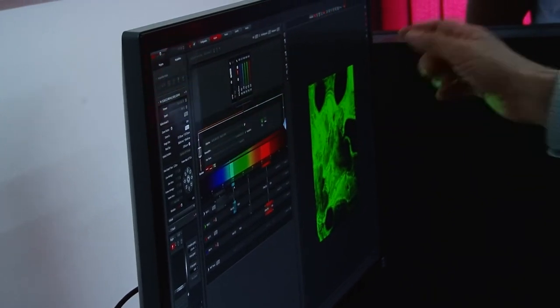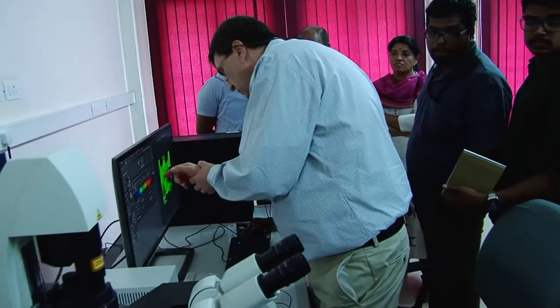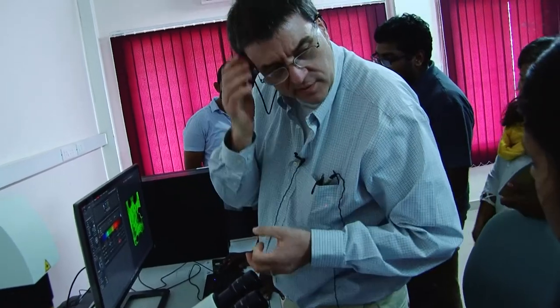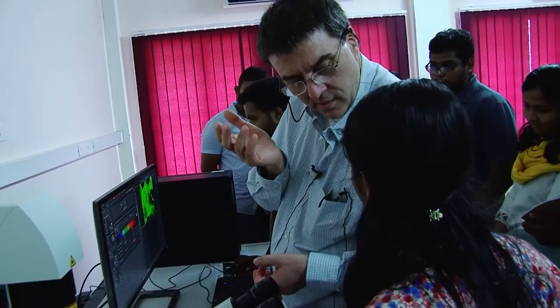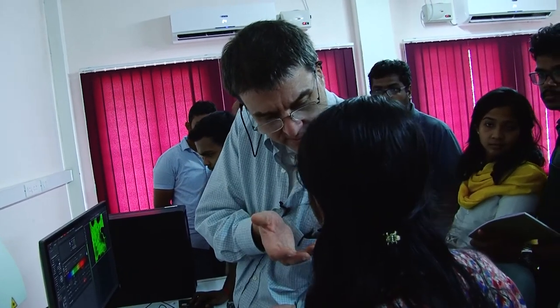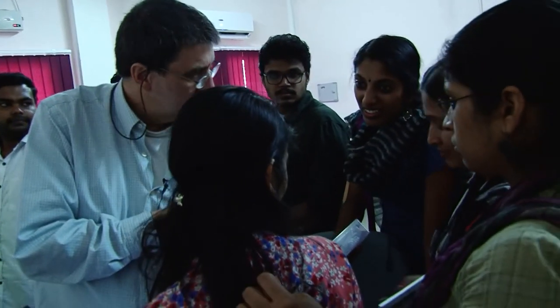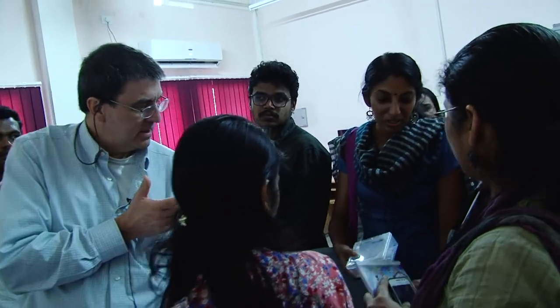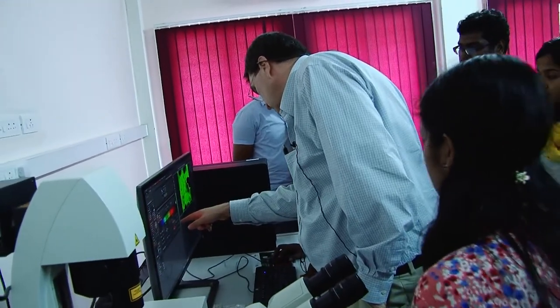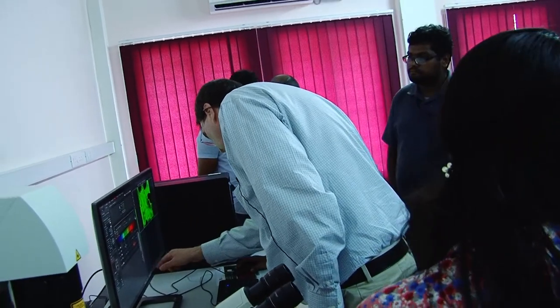Let's see where I'm in trouble with the bubbles. Like it's bouncing all over the place a little bit. Okay, can you turn the laser down a little bit more? Yeah. See, PE, I don't know off the top of my head. I'm not sure what the spectrum is. Do you know? For the phycoerythrin? I don't know it. Any idea? See if, like, in your lookup table. Yeah. Take a look at your lookup table. See if you have something called P. Like, go all the way down P.